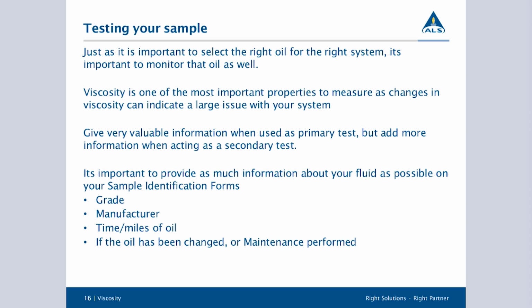It allows our diagnosticians as well as our team to know a lot more about your system and what you're operating. Then you'll also look at your manufacturer, and that's who's making your oil. The reason you want to do that is we can look at product data sheets and compare them to your results, as well as look at what your baseline should be and what is recommended. Then I refer to it as the age of the oil, but you want to know the time and the miles of the oil. We want to know how long you've been operating it.